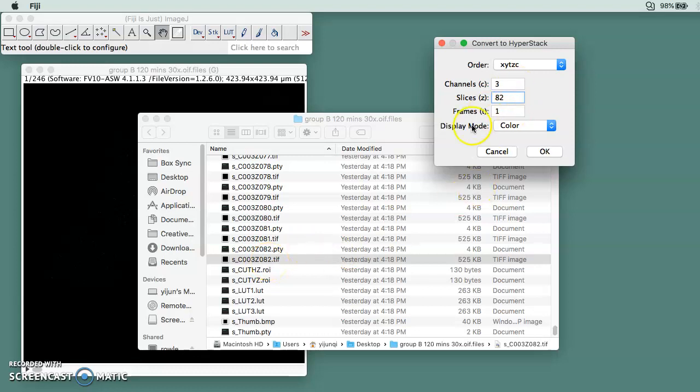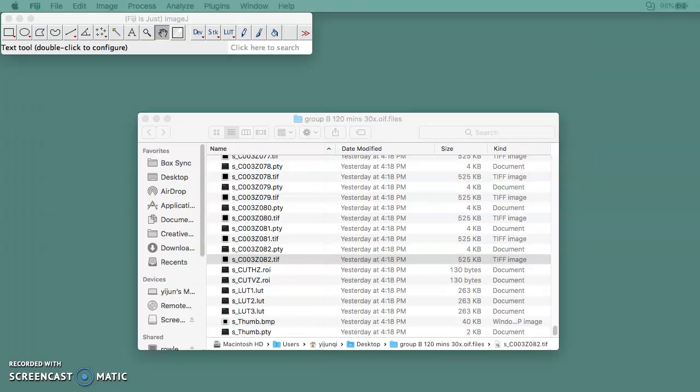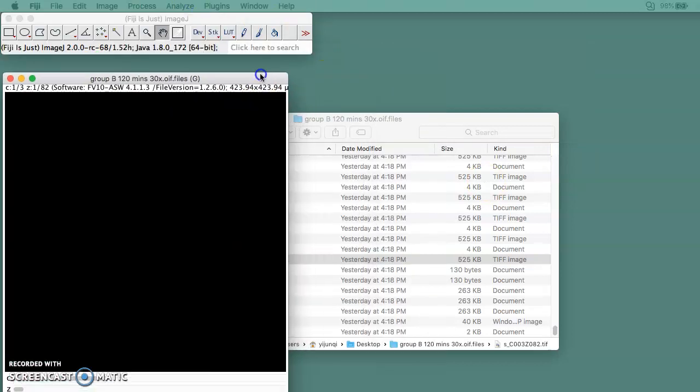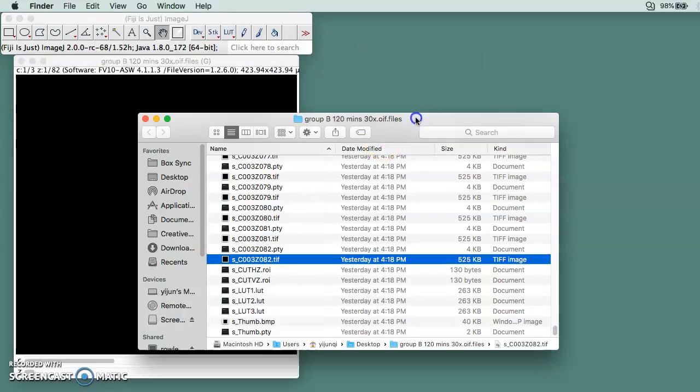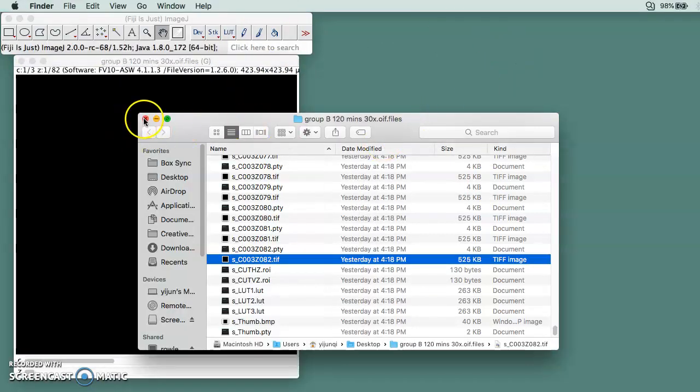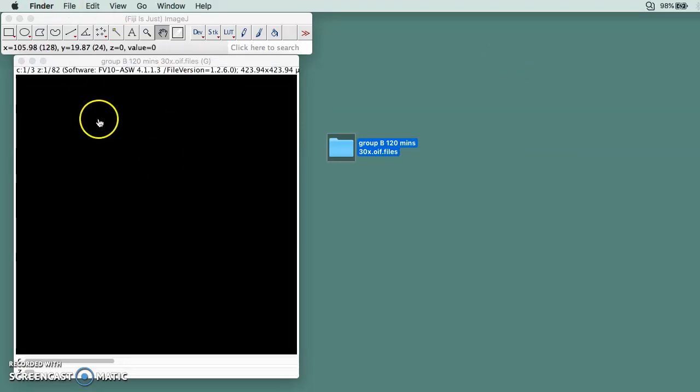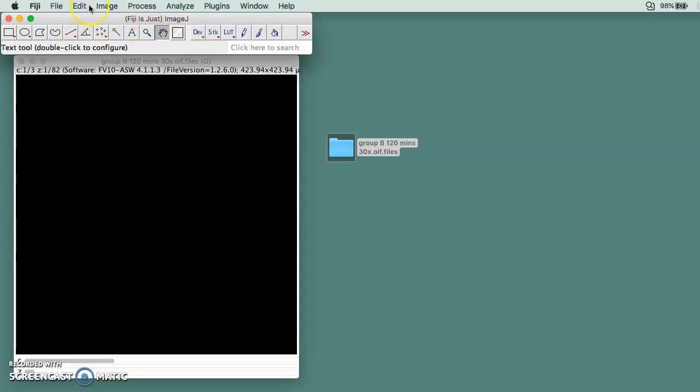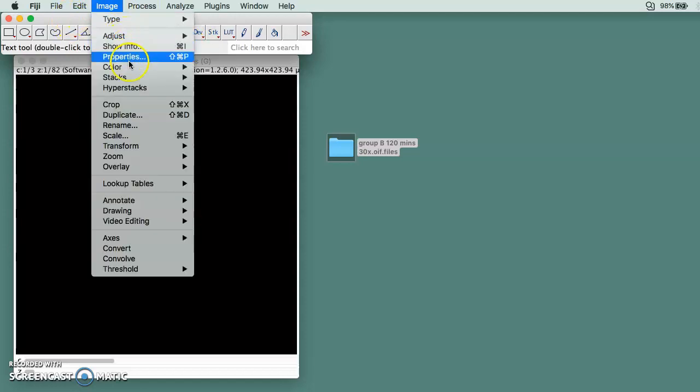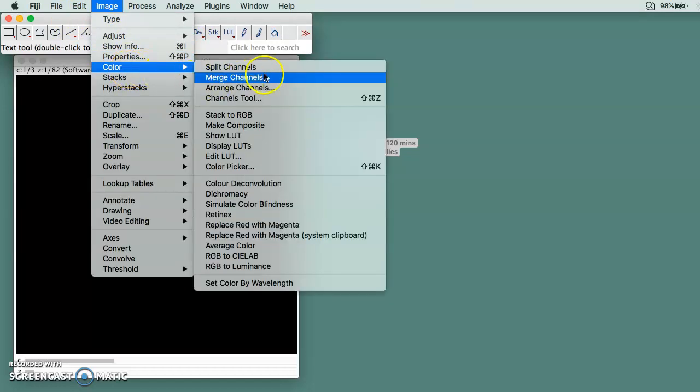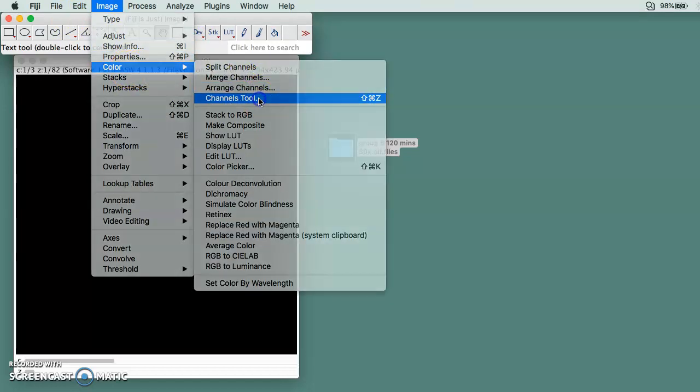The display mode should be Color and you click OK. After that, you go to Image, then go to Color, and then go to Channels Tool.